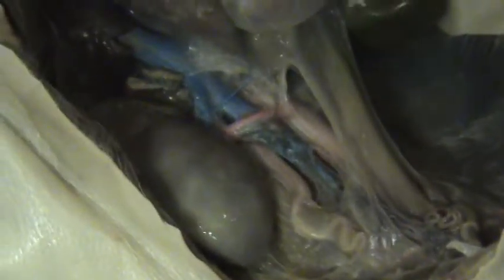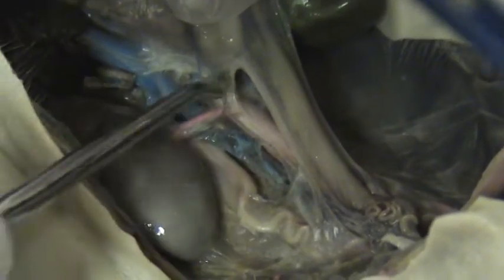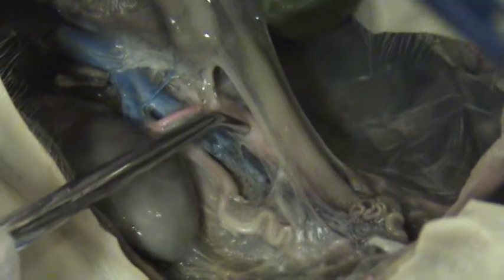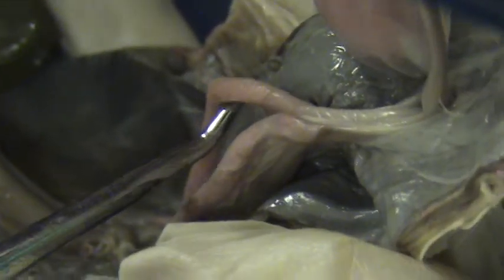Okay? So from the heart down, bringing blood to the body, and you can see the renal artery going into the kidney from it. So I use it down here a lot because you can go blue, inferior vena cava, white or pink, dorsal aorta, green, descending colon. So ureter, bladder. The pink ones on either side of the bladder are the umbilical arteries. Everybody always wants to call them the urinary arteries because they're next to the bladder. You got to fight against that. Okay. So that's the umbilical artery.